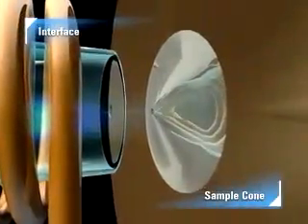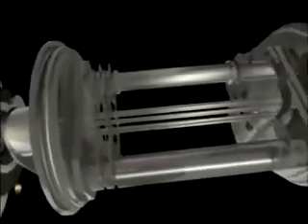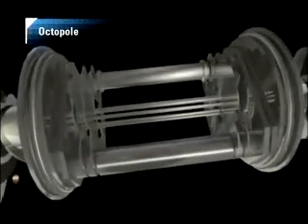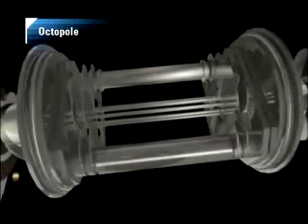The ions are extracted from the plasma into the interface through the sampling orifice, and then through the skimmer cone into the high vacuum region containing the ion lenses and mass analyzer. Electrostatic lenses focus the ion beam and separate the positive ions from the unwanted neutral species by bending them into the reaction cell, the heart of the octopole reaction system, or ORS. The ORS is unique in using an octopole ion guide in the cell rather than the hexapoles and quadrupoles used in other cell ICP-MS systems.